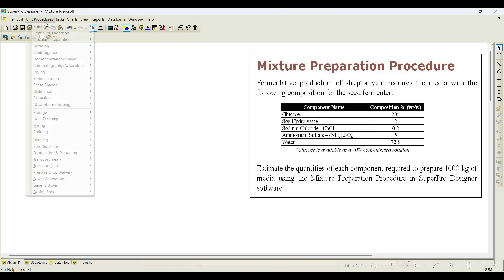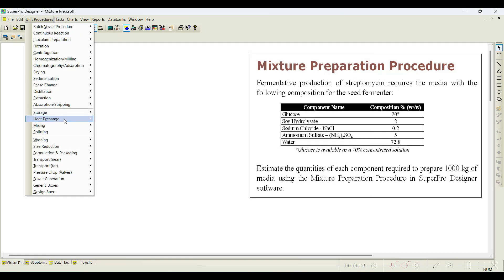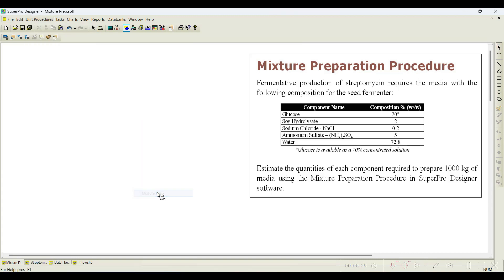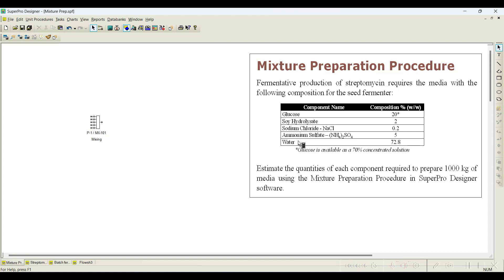Now let us go to Unit Procedure and add the mixture preparation — available under Mixing > Bulk Flow > Mixture Preparation. Click it, and you can notice there are five inputs and one output available. In our example problem we also need five inputs, so let us add the streams.